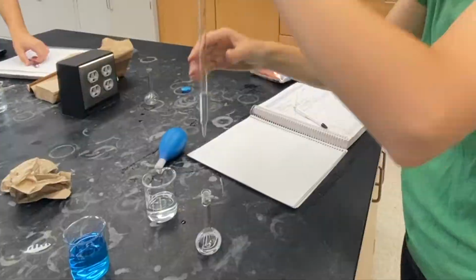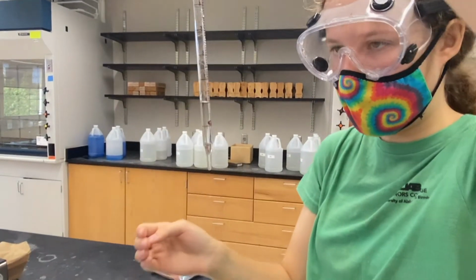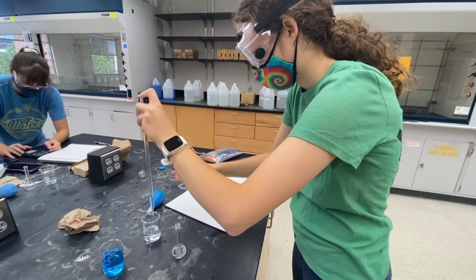When pipetting, it is important to be careful not to draw the solution up too far into the bulb. This will contaminate the bulb and mess up the calculation. Now we transfer the solution to the volumetric flask.